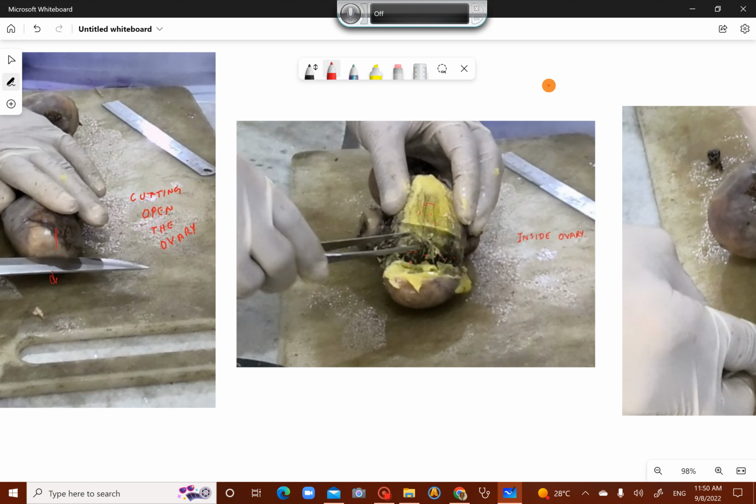So this ovary, which was enlarged in size and semi-solid because of these yellowish, semi-solid contents, and these are hairballs. These are very typical findings of a mature teratoma.